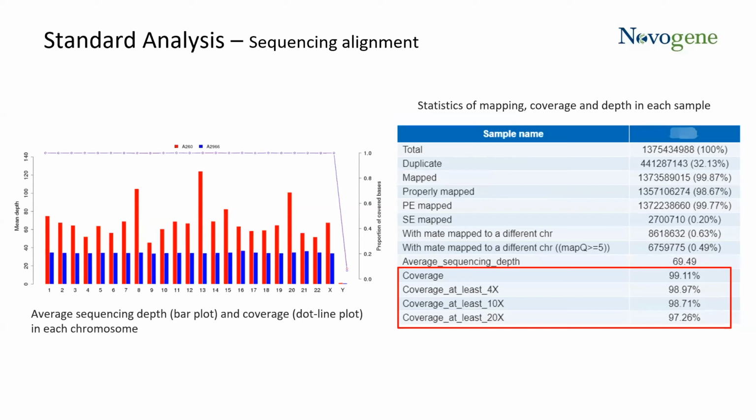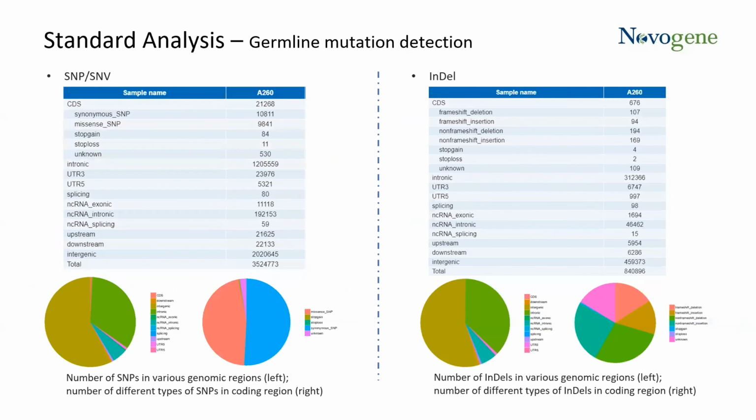To summarize all the data acquired, we can issue you a table with all the information obtained in the mapping, coverage, and depth measurements. So further into our analysis is the detection of single nucleotide polymorphisms, insertions, and deletions. For that, the HaplotypeCaller is used to perform variant calling to identify any of the mentioned variations.